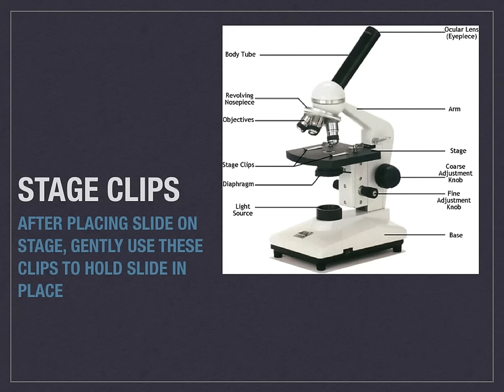The stage clips are what you use to hold the slide in place. As you place your slide on the stage, you gently raise these clips up to hold the slide into place.